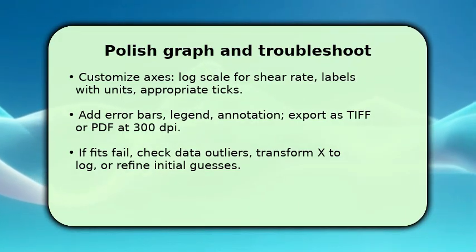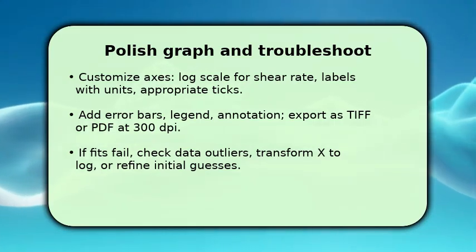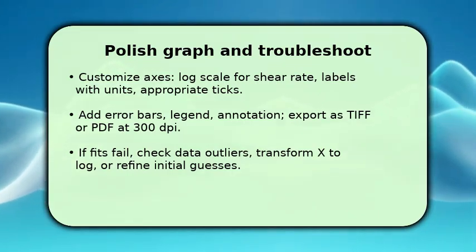If the fit fails or is unstable, inspect for outliers, try transforming X to log, or refine initial parameter guesses. Rerun with different weighting. That's troubleshooting.